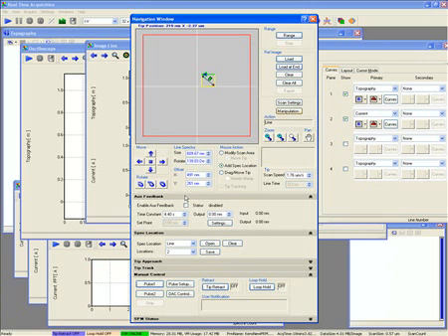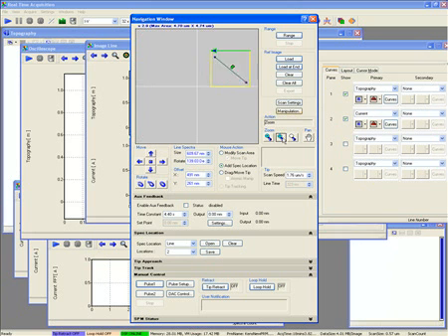One new addition is the pan feature. This can be useful when you zoom into an area and you lose sight of your image window. Another addition is the Load at End feature. Load at End can be used to automatically load an image into the navigation window upon completion of the scan.